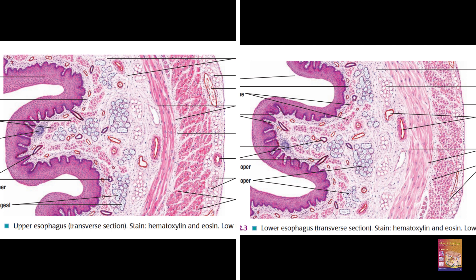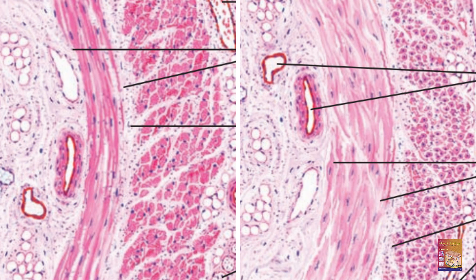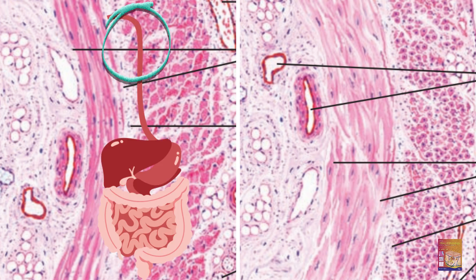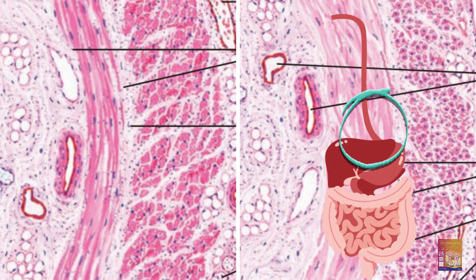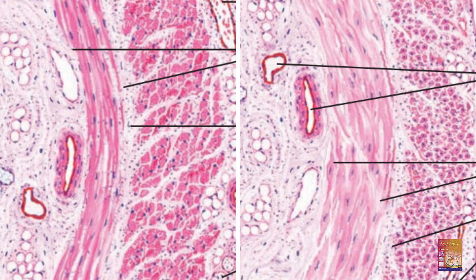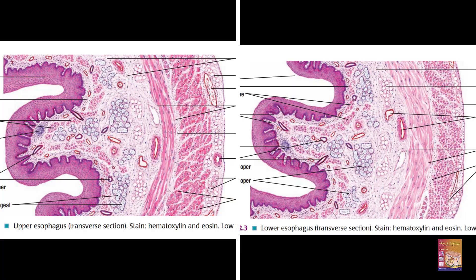Both sections show the inner circular and outer longitudinal layers. Zooming into the first picture, all the nuclei are situated peripherally in both layers, so this is obviously skeletal muscle — this section is from the upper third of the esophagus. In the second picture the nuclei are placed centrally in both layers — these are smooth muscle fibers without any doubt — so this section is from the lower third of the esophagus. And there you have it: a quick dive into the histology of the esophagus.